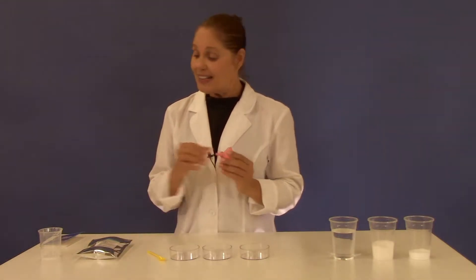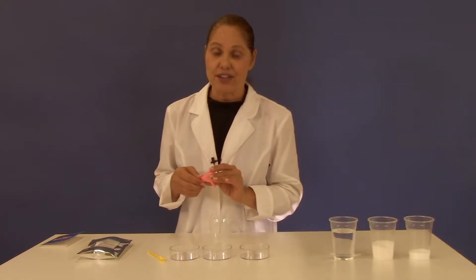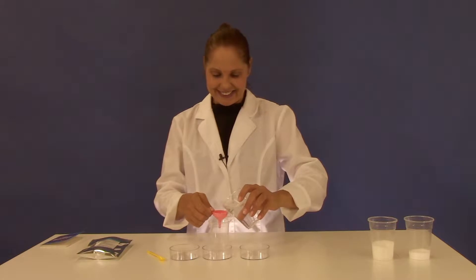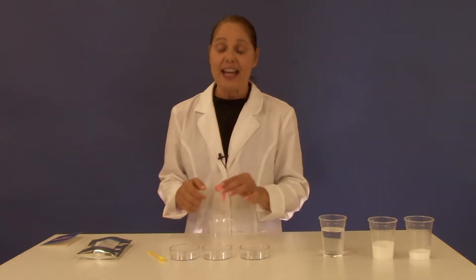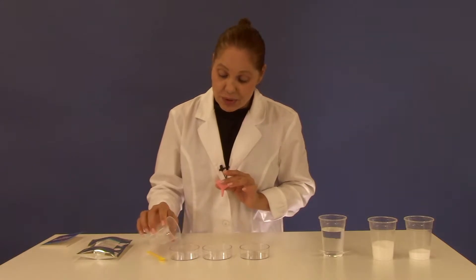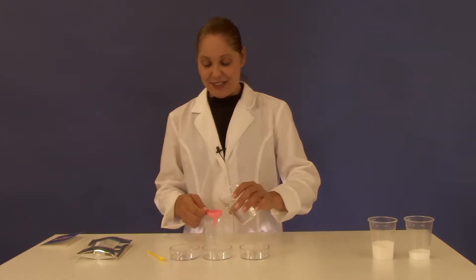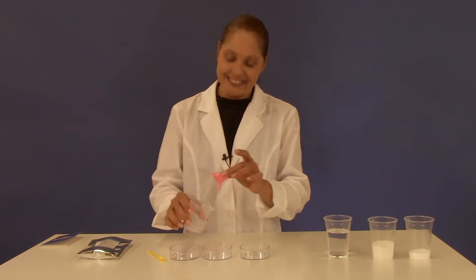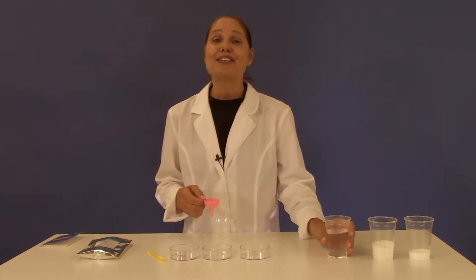Using your funnel and the beaker, measure 15 milliliters of water into the beaker. Then pour that into your petri dish. Do this for each of the petri dishes — 15 milliliters of water, and 15 milliliters of water.